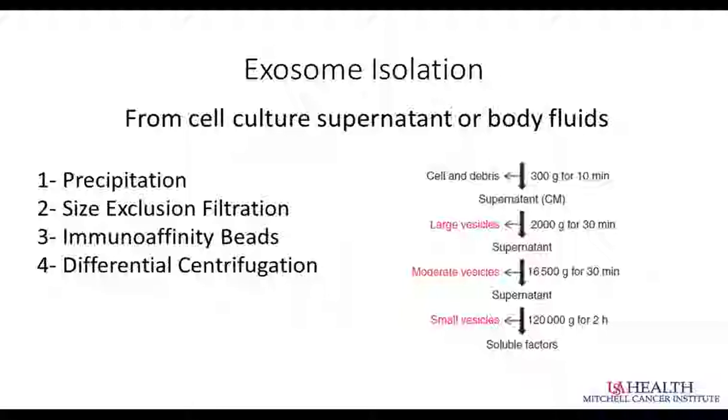But we've seen that they might not even be suitable purity for even doing Western blots. We certainly have not had any success using precipitation kits for purifying them to do flow cytometric analysis. They seem to be very sticky after whatever chemicals are used to do that precipitation.